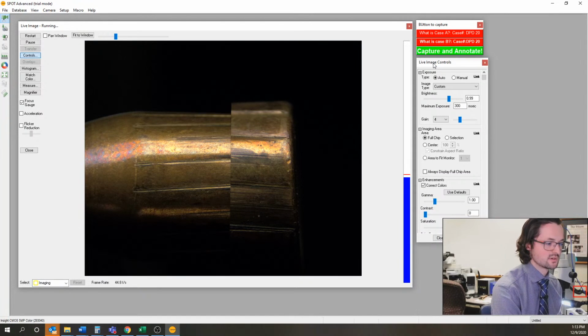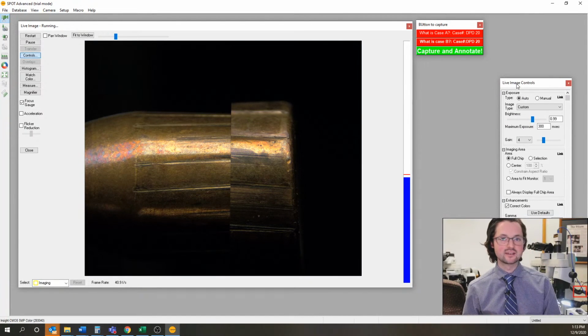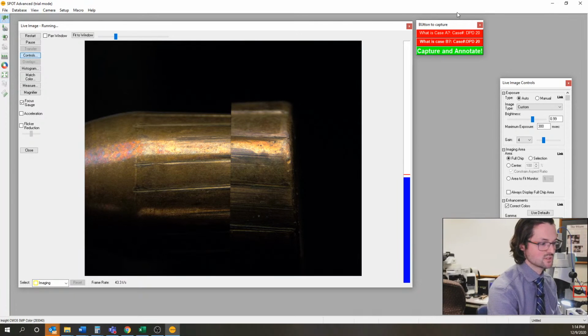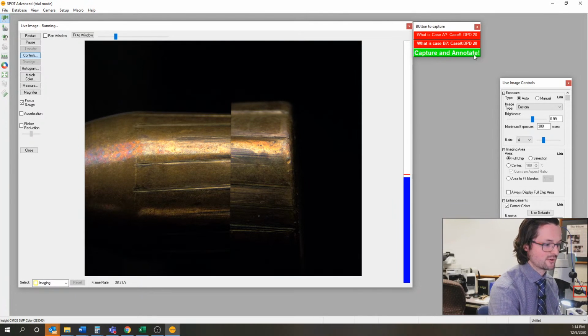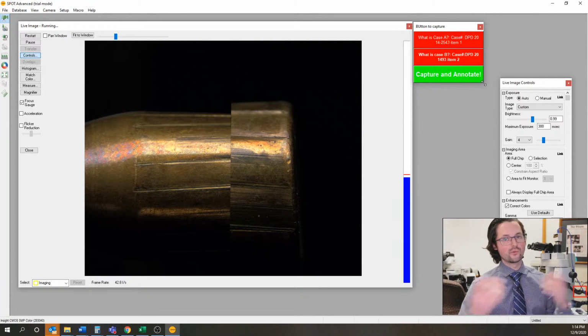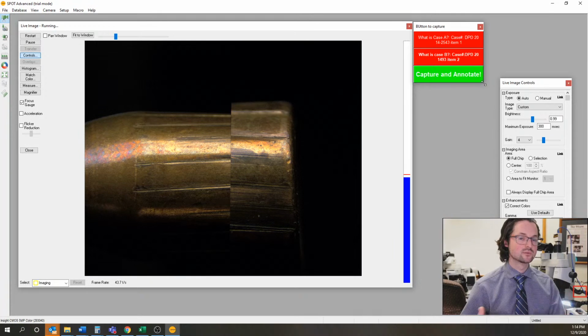And the macros can look a little intimidating, but essentially what they do is they give you a lot of ability to program things. So the best way is to show. This is a macro I created, or helped the lab create. And I'm happy to share this macro with people if they want to download it and try it. I always find it's a lot easier to start from a macro than just to create one fresh, because then you can edit and see what's going on.